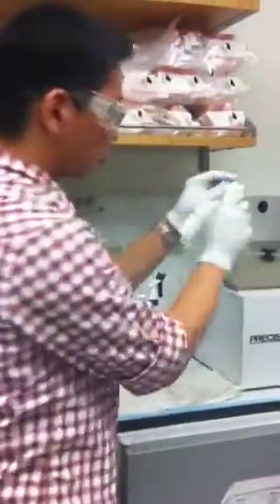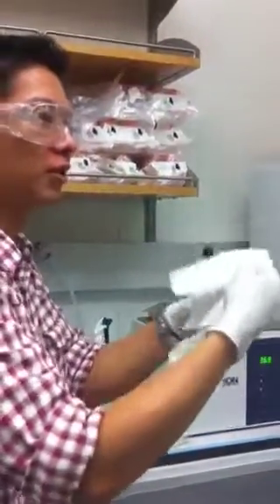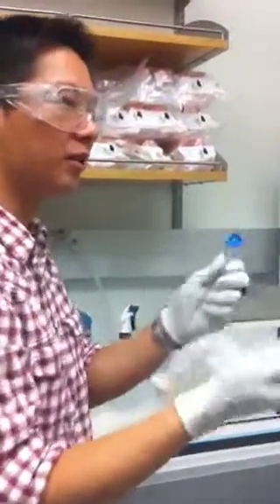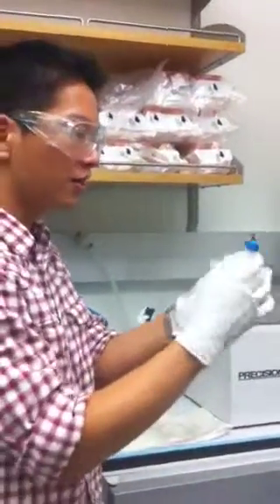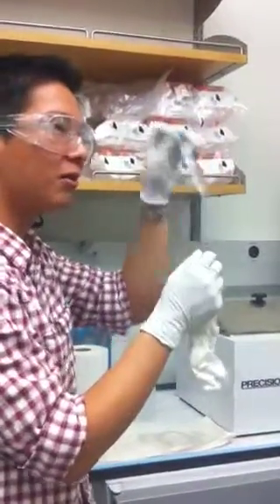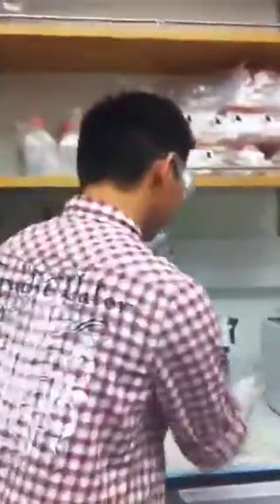Sure. So trypsin, you don't want to keep it at room temperature too much. They do clean themselves. Other than digesting other proteins, they also digest themselves. So you don't want to keep them at room temperature too much. That's why we add trypsin in small parts, so we are not heating up all of it at once.